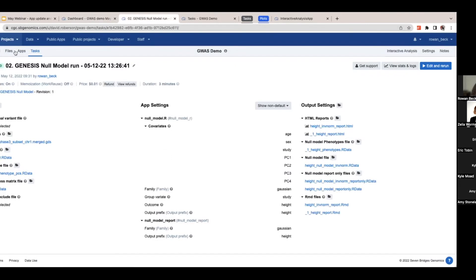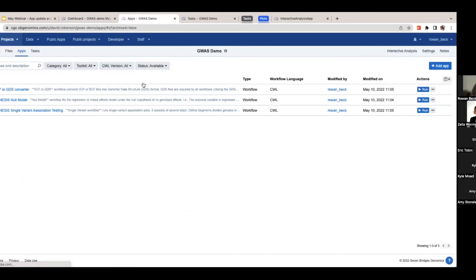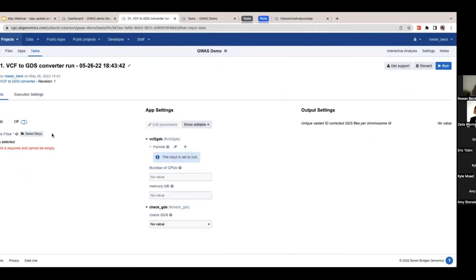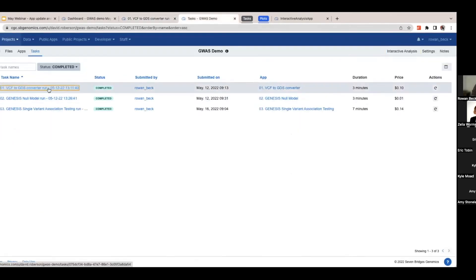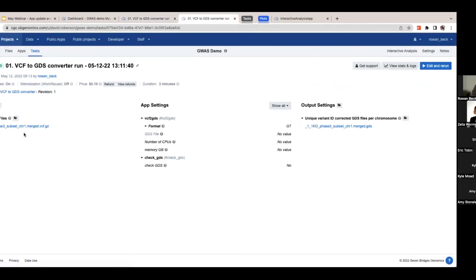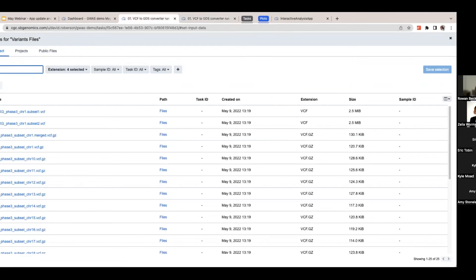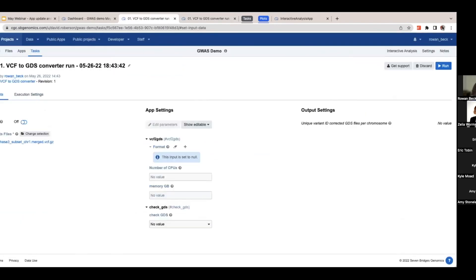Going back to the project, clicking the apps and wanting to run the VCF to GDS converter, all I have to do is click Run. It will ask me which file I'd like to use. I can go back to my tasks to double check which one I used — the subset chromosome one merged VCF. I can search for 'VCF' to see what comes up, select the file, click Save, and then click Run.